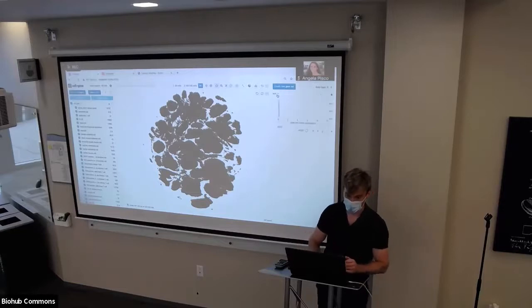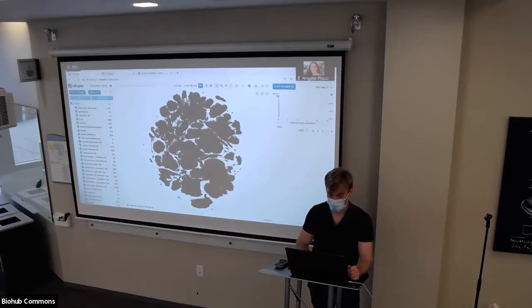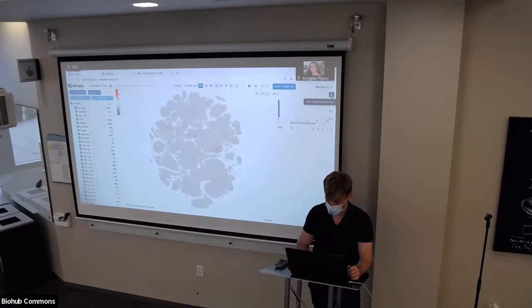Could you also see the cell types that have the lowest level of ACE2 expression, in addition to the 3 highest cell types? Yeah, so let's see how we would do that. I haven't done something like that, but maybe we can check it out. So we'll color by ACE2.